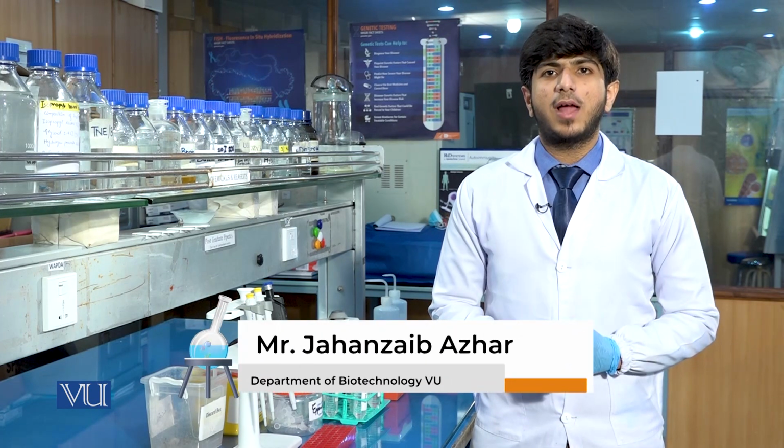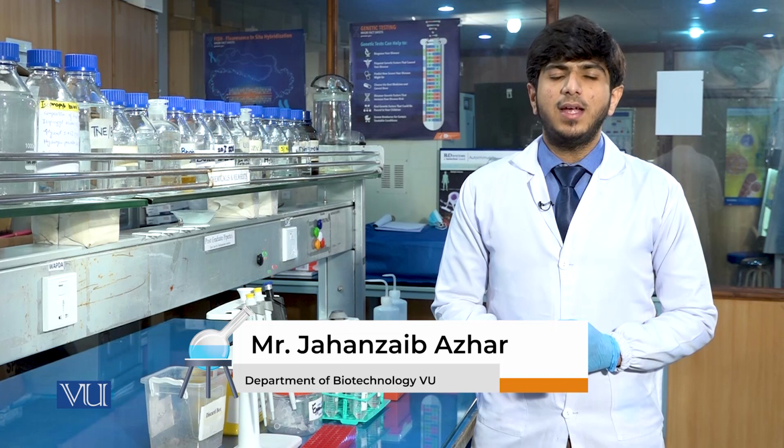Today, we will discuss DNA extraction. Extraction and purification of DNA is required for various molecular biology techniques. DNA can be extracted through different methods, including the organic method, the inorganic method, and even through commercially available kits. We will extract the DNA by the organic method.